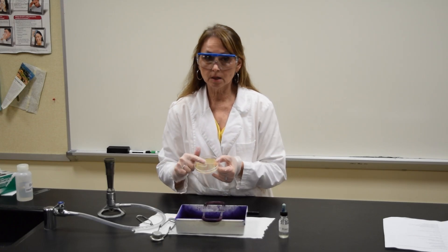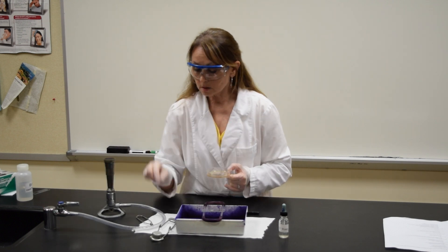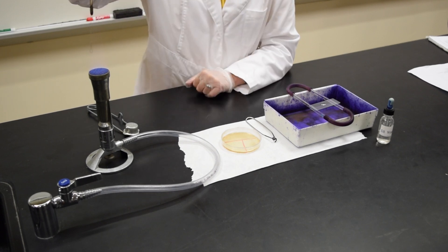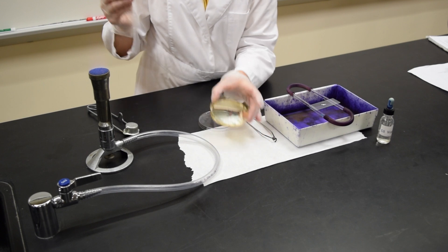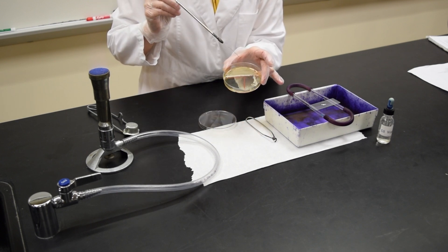I'm going to be taking my sample from a colony on a petri plate. Turn on your Bunsen burner and sterilize your inoculating loop. Take off the lid of the plate, and if there's an area on the plate where you can cool the loop, do so.